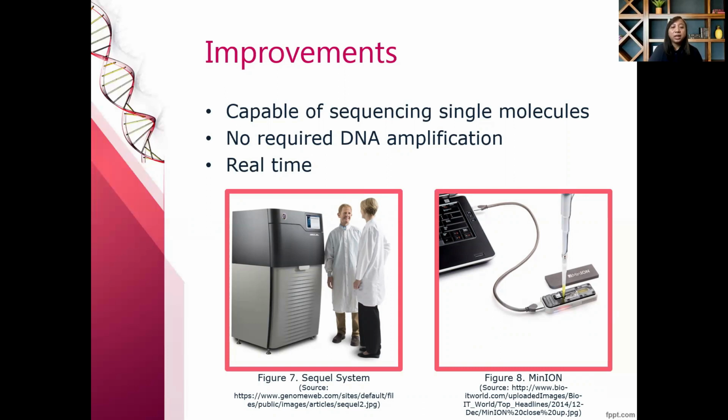For Sanger sequencing, a large amount of template DNA is needed for each read. Several strands of template DNA are needed for each base being sequenced, as a strand that terminates on each base is needed to construct a full sequence. In next generation sequencing, a sequence can be obtained from a single strand. In both kinds of sequencing, multiple staggered copies are taken to continue the construction and the sequence validation.